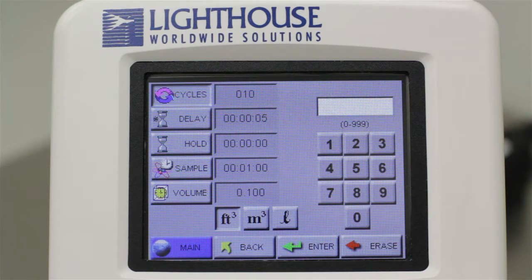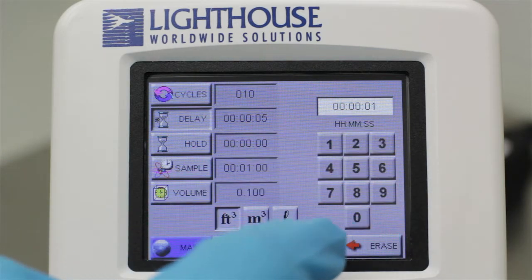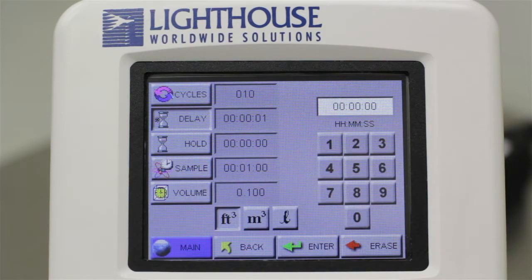If the Cycles value is set to zero, the particle counter will take continuous samples until the user manually stops the unit. The Delay button will set a one-time initial delay. This delay countdown will start once you start your sample, and during this time no particle counts will be taken or recorded. Once the delay is complete, your first sample will be taken. Enter your desired delay time in the same way as the Cycles value, and make sure to press the Enter key for the particle counter to accept the new value.